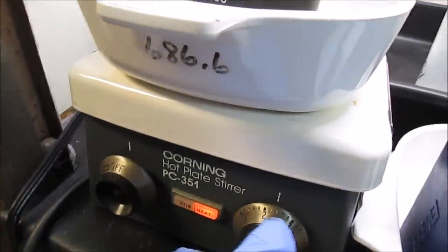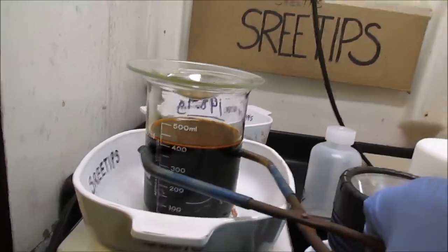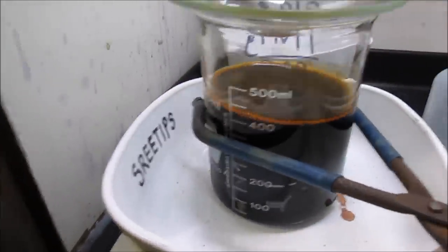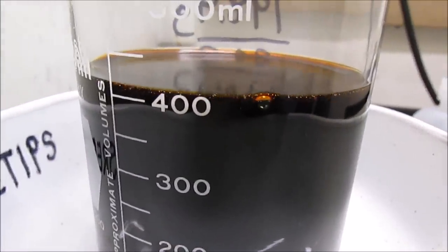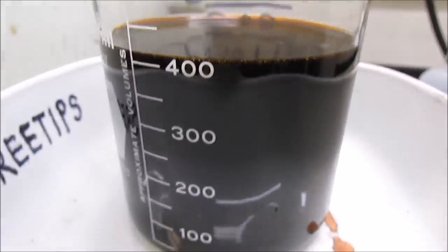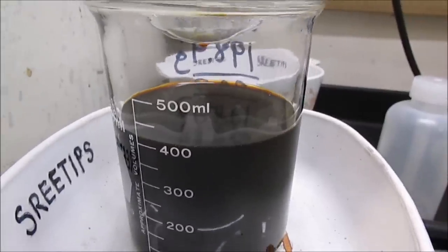I'll turn off the stir bar, turn off the heat, and lift this up to see if there's any metal down in the bottom. It doesn't look like there's anything down there — I may have gotten it all dissolved. I'm just going to let this cool off, then filter it and proceed with the separation. I've turned the heat off and I've still got a little bit of bubbling action going on. I'm going to put it in an ice bath and let it cool down so I can run it through a filter.